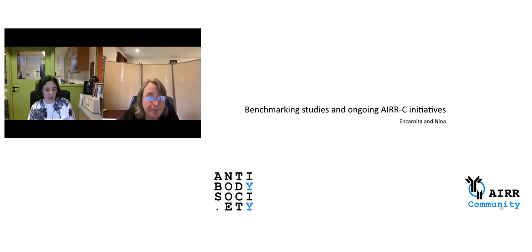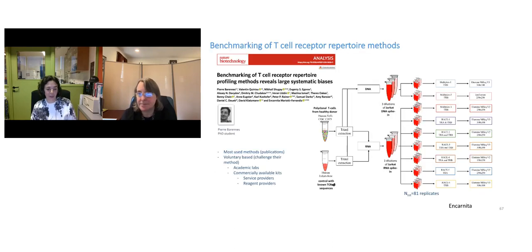So with this, we are going now to conclude in a few slides on benchmarking studies and ongoing AIR community initiatives, because QC is one thing, but to make a QC, you also need to know what you are going to do. And benchmarking the tools is one important thing.